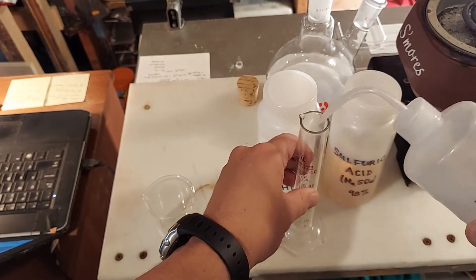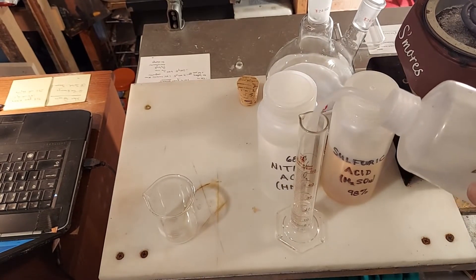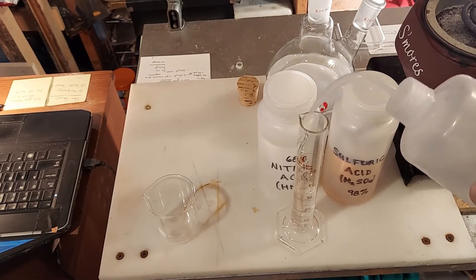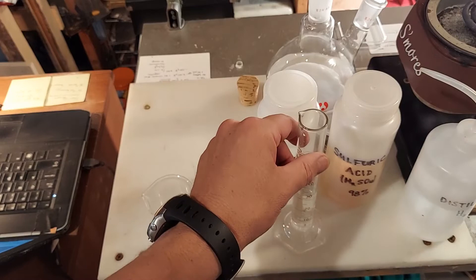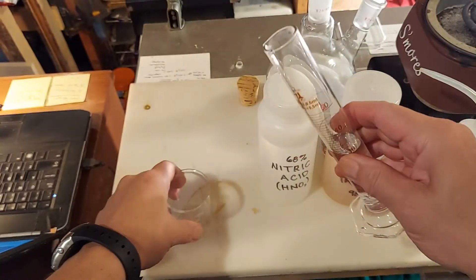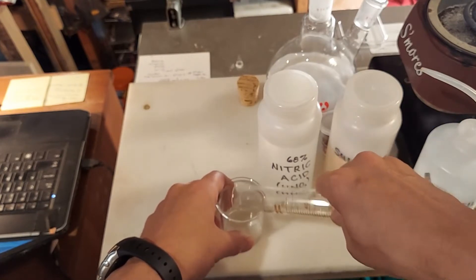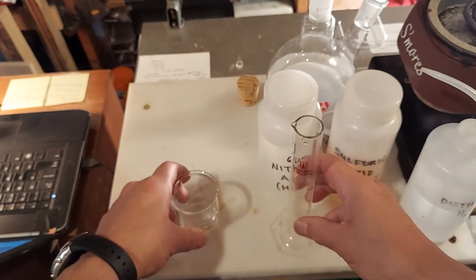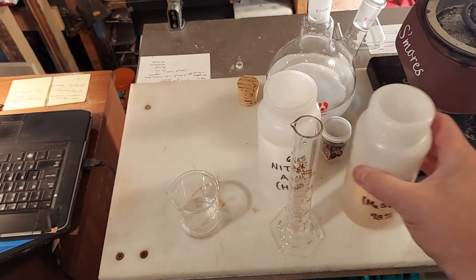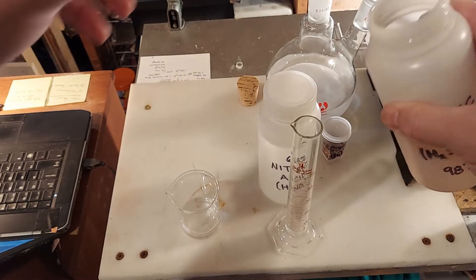Alright, we've got our graduated cylinder, our sulfuric acid, and our nitric acid here. We need 30 cc's of distilled water — let's keep filling until we get to 30, as marked very clearly on the glass cylinder. Alright, 30 — place it in our beaker. We then need 5 ml — a very, very small amount — of sulfuric acid.